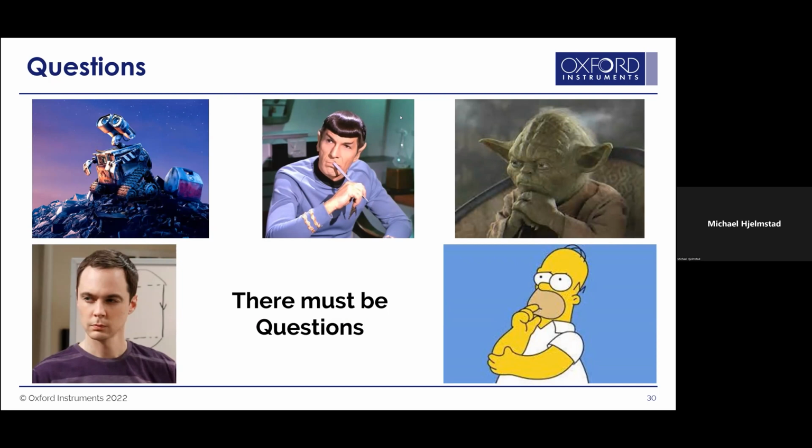So for an individual map, probably no big deal whatsoever to go to the lowest magnification you can get to. If you ever were to stitch together maps to do a whole large area, you'll see that effect really jump out quickly. When you talk about quantitative analysis, that's where I want to be at higher magnification. If you're not in the center of your field of view, you want to be at something closer to about 1000x or even 2000x to make sure that you really are not losing any count rate across the entire sample to do good quantitative analysis.